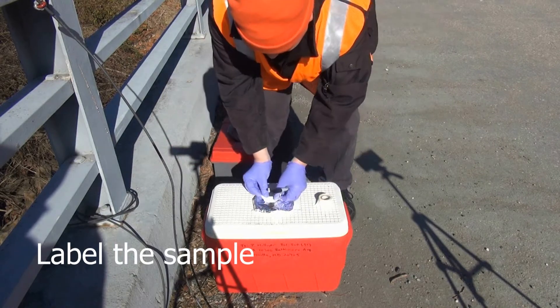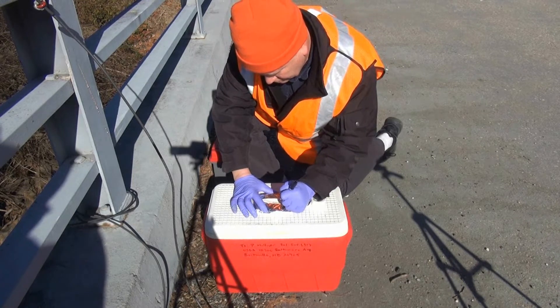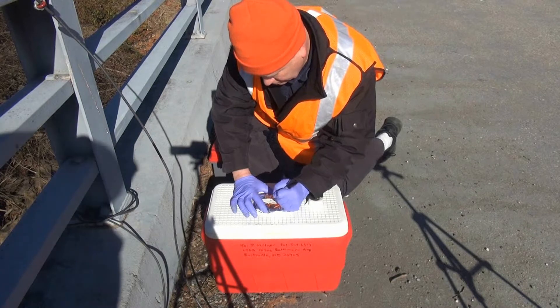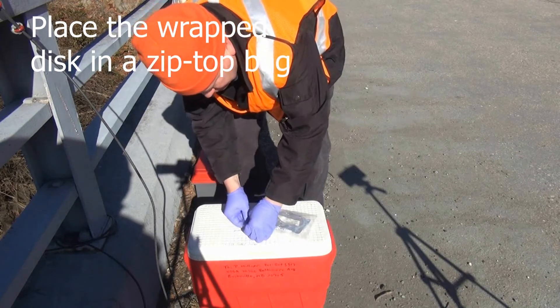Label the sample with the collection site and date. Place the wrapped disc in a plastic zip-top bag, again taking care not to puncture the membrane.